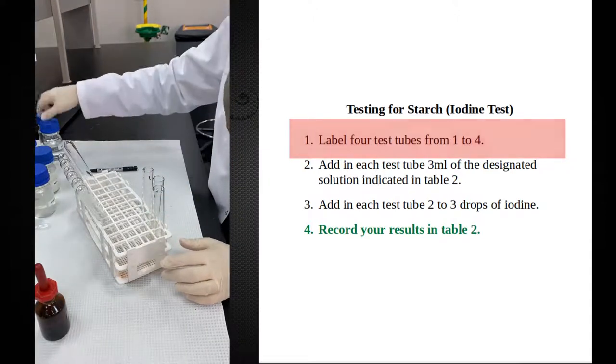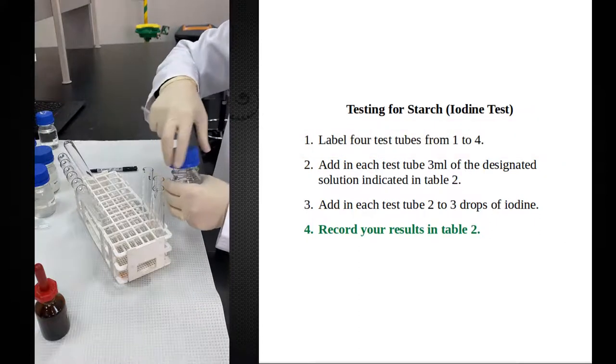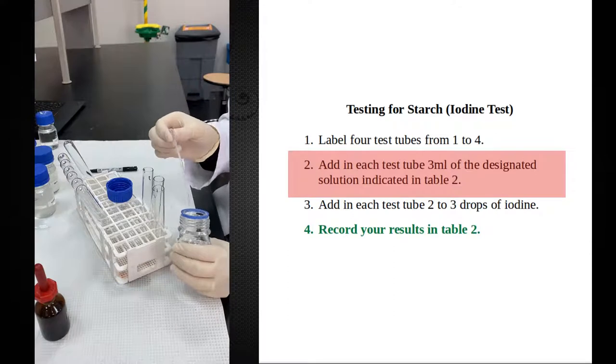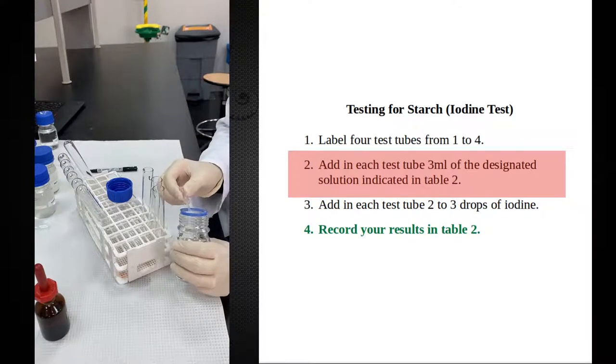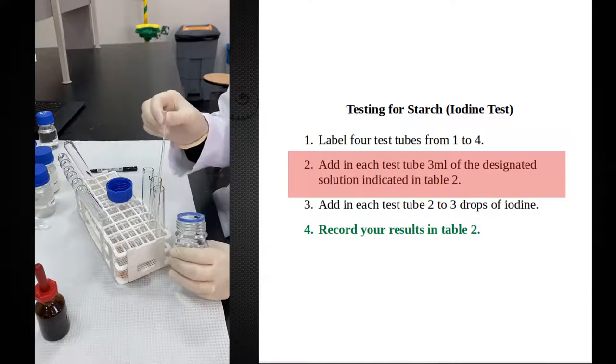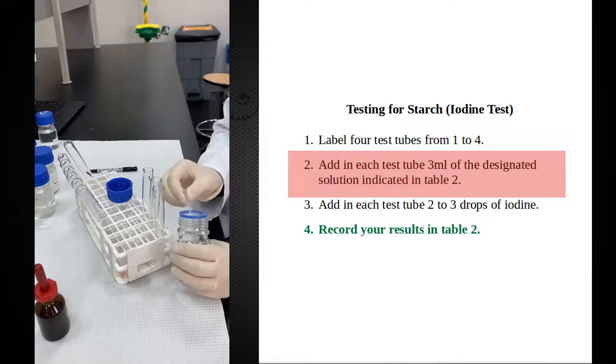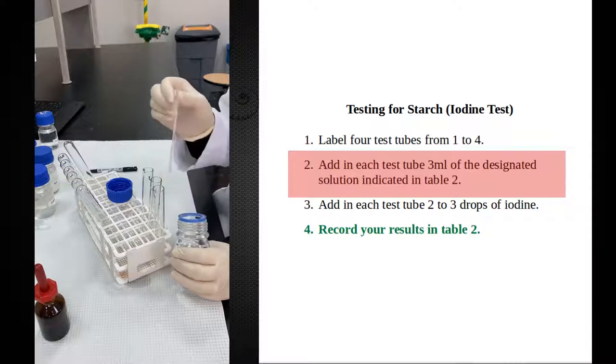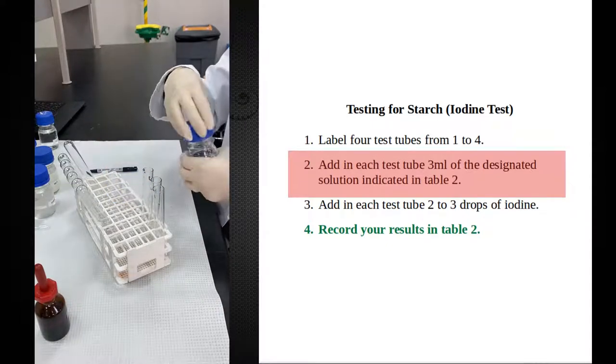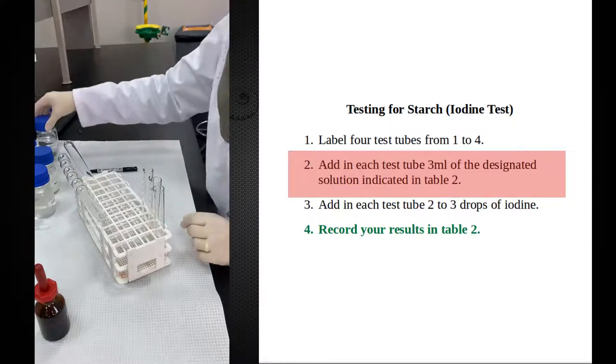In the first test tube, as I'm doing in all the tests, I will add negative control. My negative control is distilled water. I will add 3 ml this time to make the result more visible. Distilled water has no organic compounds, and therefore this is my negative control. I know it is going to give me negative results. I'm using it to compare my results to it.